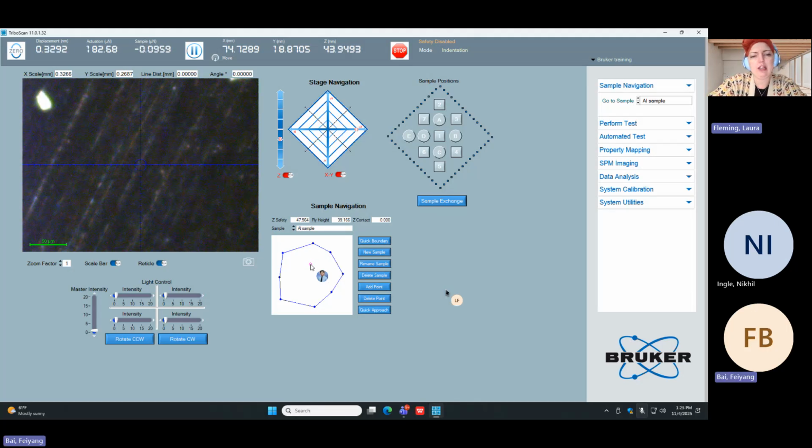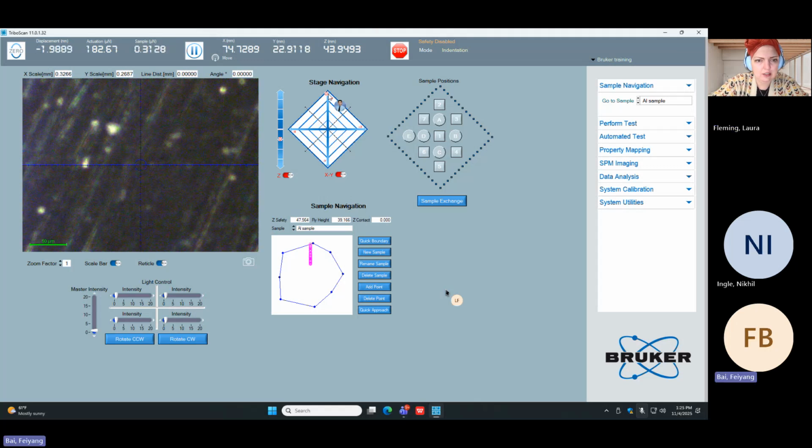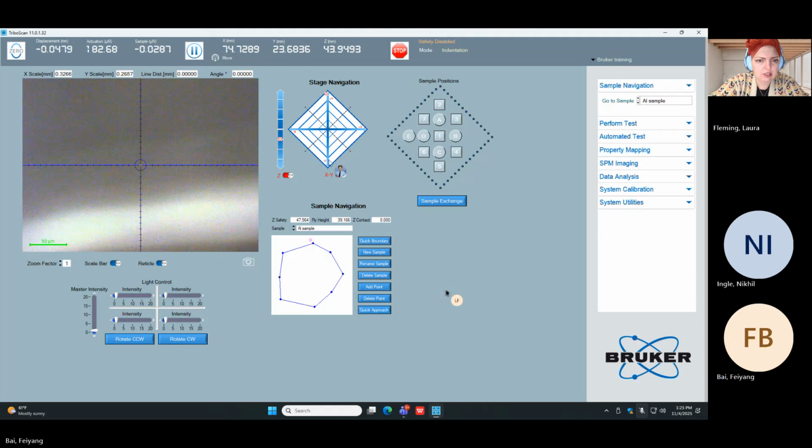Oh, this isn't terrible. Okay. So let's go ahead and can you drive due north to find the top of the sample and see how close that is? North, not up. Yep. And see if our sample definition zone is correct. That's pretty close.